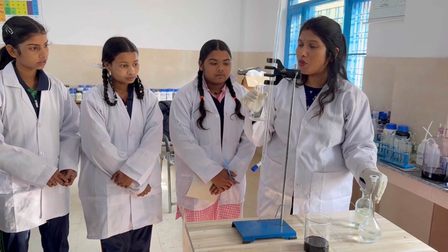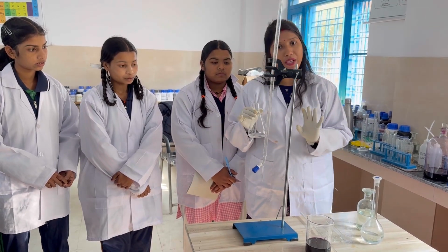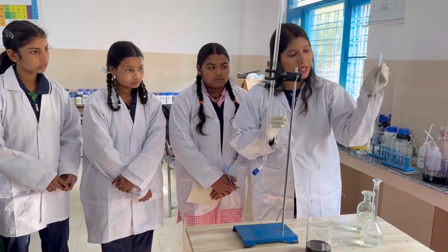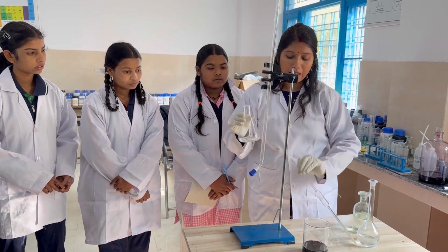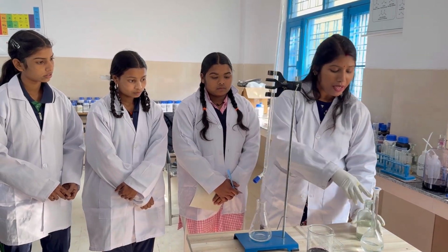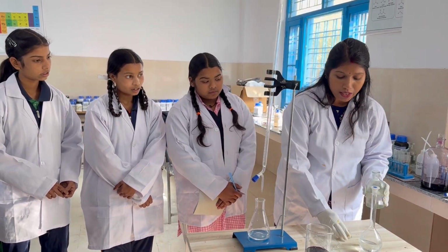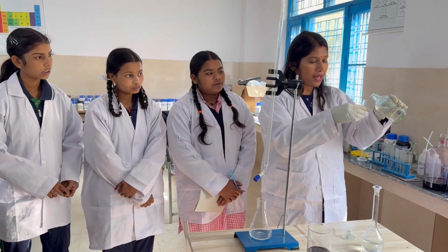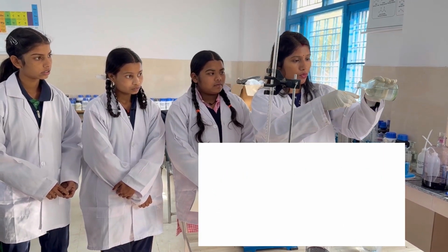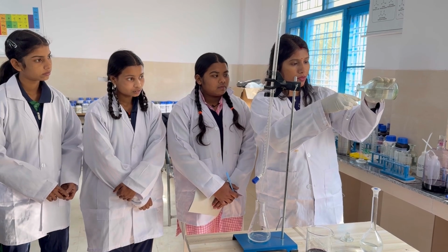We pipette out 20 ml Mohr salt into the conical flask. After that, we will add 10 ml dilute H2SO4 into the Mohr salt. One test tube is equal to 10 ml. So we'll add one test tube of dilute H2SO4 into the Mohr salt.